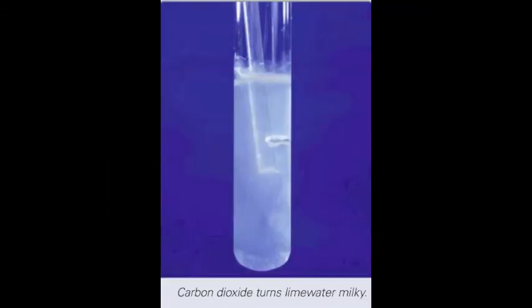Carbon dioxide is given off when an acid is added to a substance containing carbonate ions, CO3-2. Lime water is used to confirm the identity of the gas. Lime water turns milky when carbon dioxide is bubbled through it. So adding a carbonate to an acid, and seeing the fizzy bubbles turn lime water milky, is a test for the presence of carbonate ions.